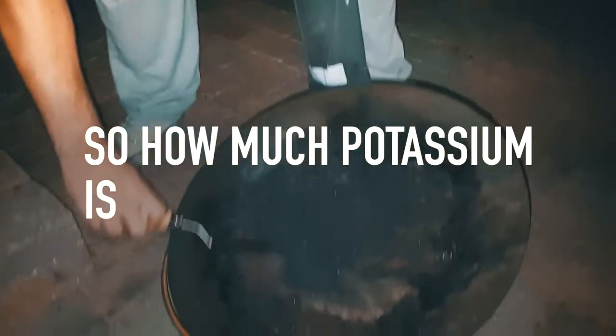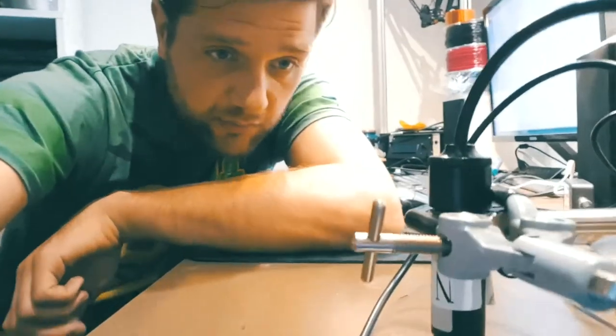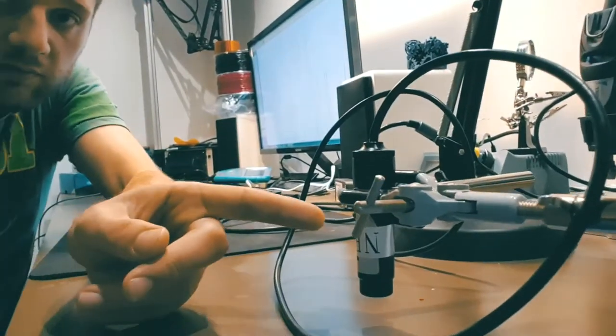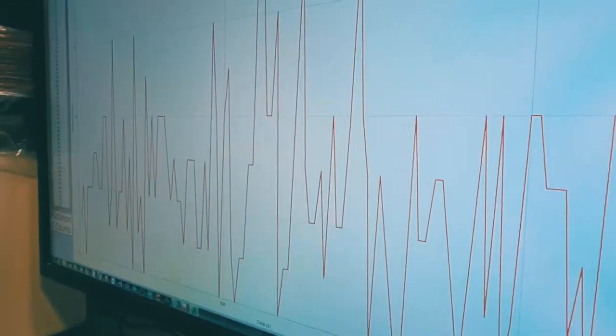So how much potassium is actually in this ash? We can figure that out by measuring it. Here we are measuring the background radiation — the measurement is going on at the moment. Now why do we measure the background radiation? Luckily I have a good friend who's a physicist, and I'll let him explain that for you.